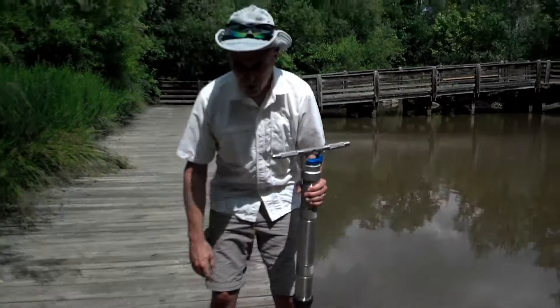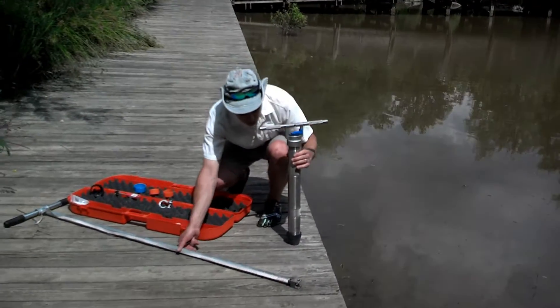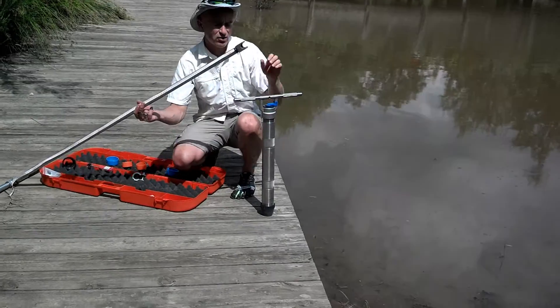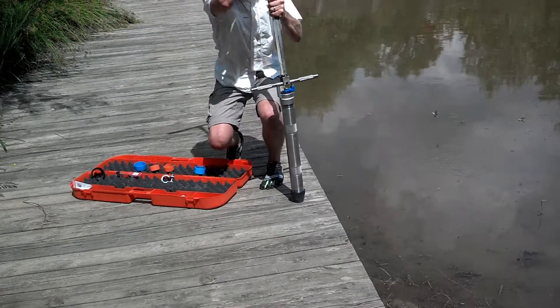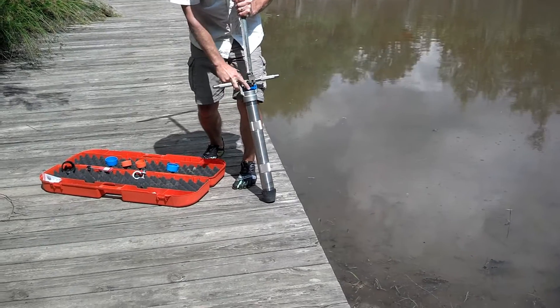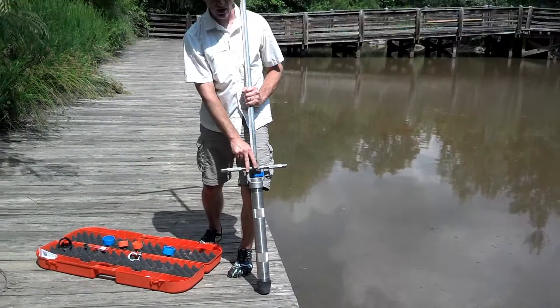If the lake is deeper, we may need to use an extension handle. We have this extension handle which will simply go right on top like this, bolt into place, and now we have a much longer coring device.